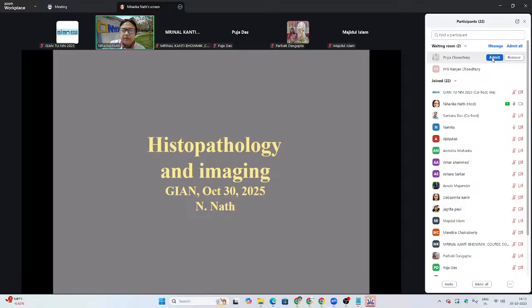Welcome to our tutorial today. In this tutorial session, this is about histopathological imaging, and I'm calling it histopathology and imaging because it's not solely imaging. So we will go through some of the basics of histology. I did show you a video of some essentials. That was just the basic, and we will cover that a little bit. We will not do a video, but we will go through some of the major processes.